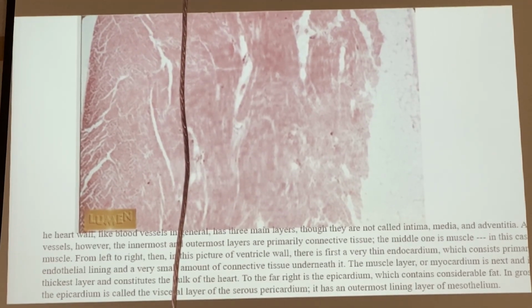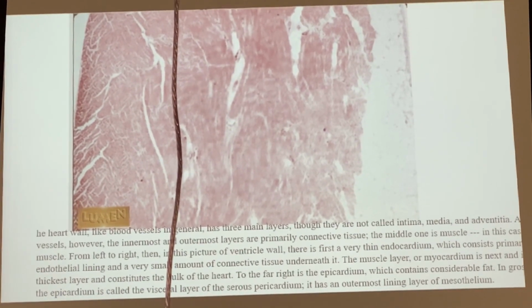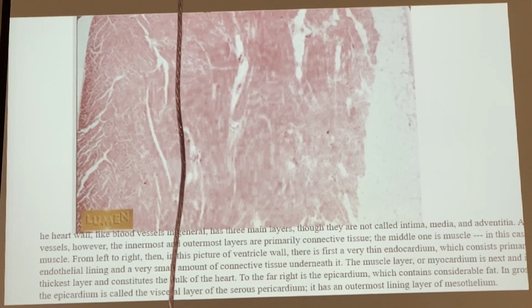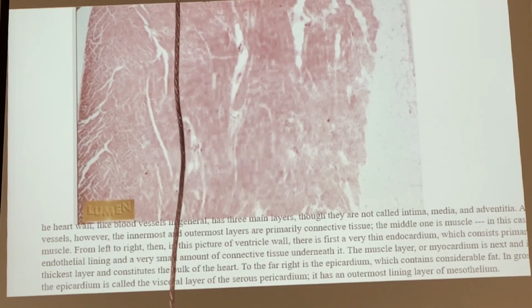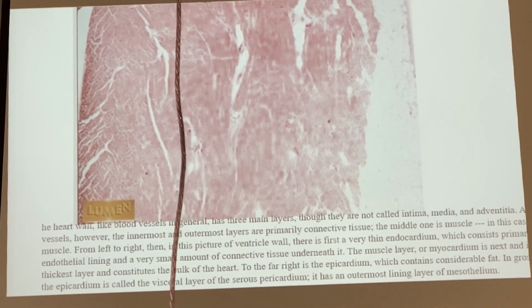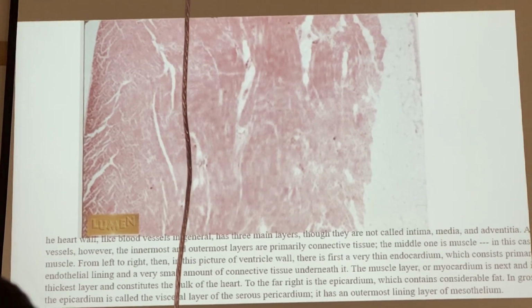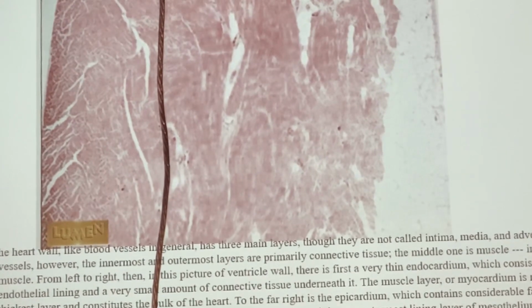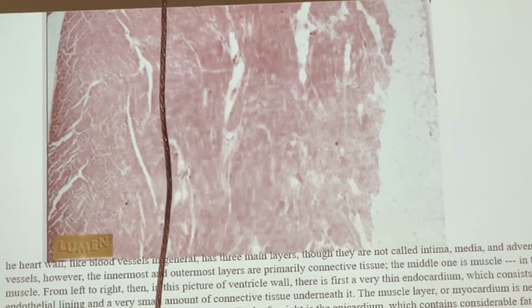The papillary muscles are projections of the musculature of the ventricles to which the chordae tendineae are attached. The chordae tendineae is a band of fibrous tissue which connects the valves to the papillary muscles to prevent the reflux of the valve into the atrial lumen. Okay? All these structures are lined with endothelial cells.